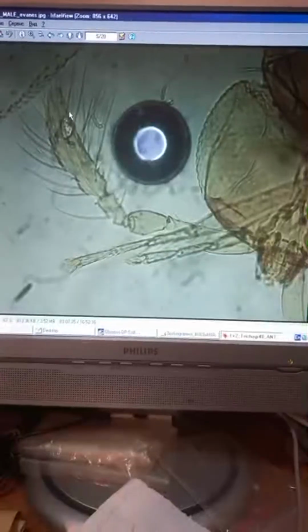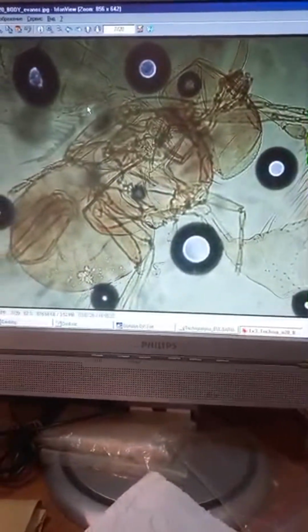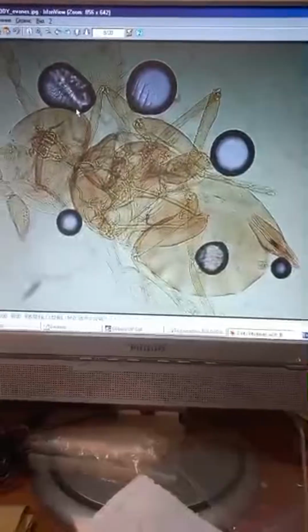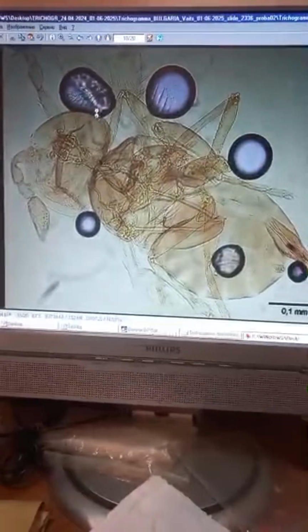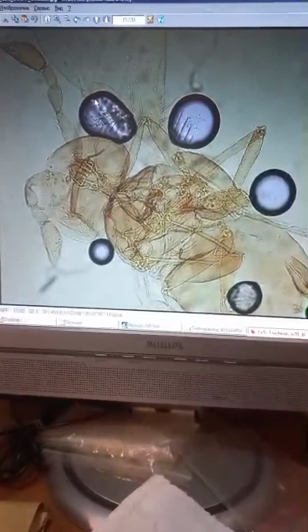But what's about body? This is like male antenna. What's about body? Body of female with ovipositor. This is body of female with antenna of male. Another individual. This is a male. But what's about antenna? Antenna of female. Strange. You see, antenna of female. So part of features belong to female, part of features belong to male.